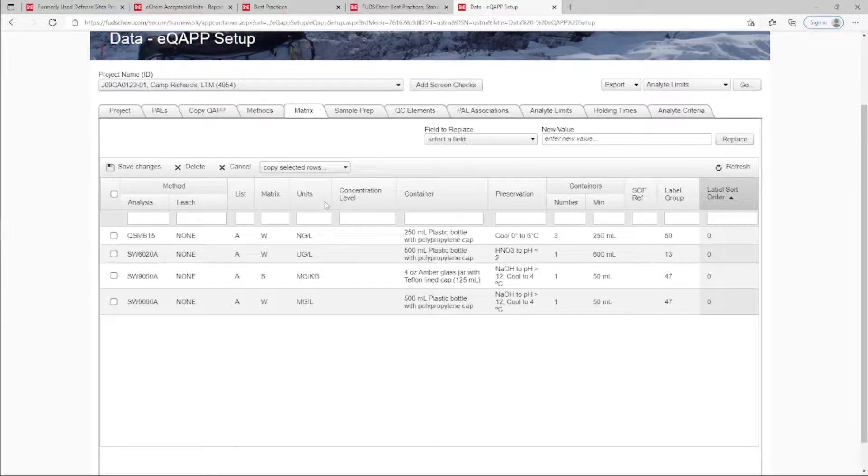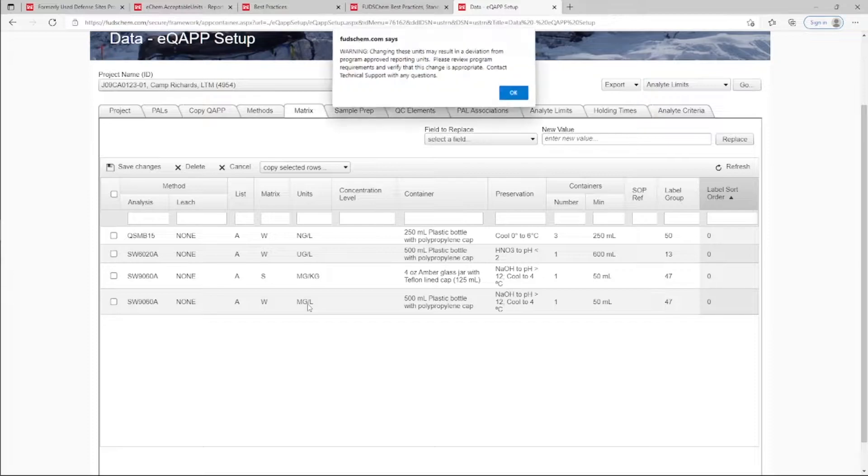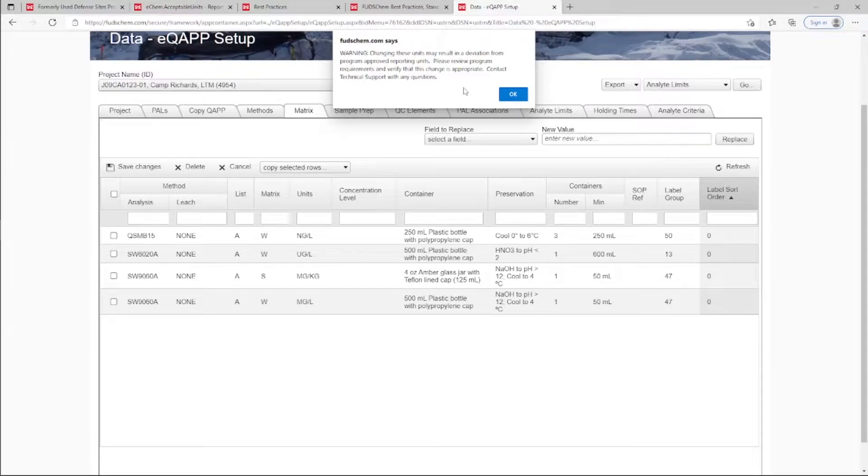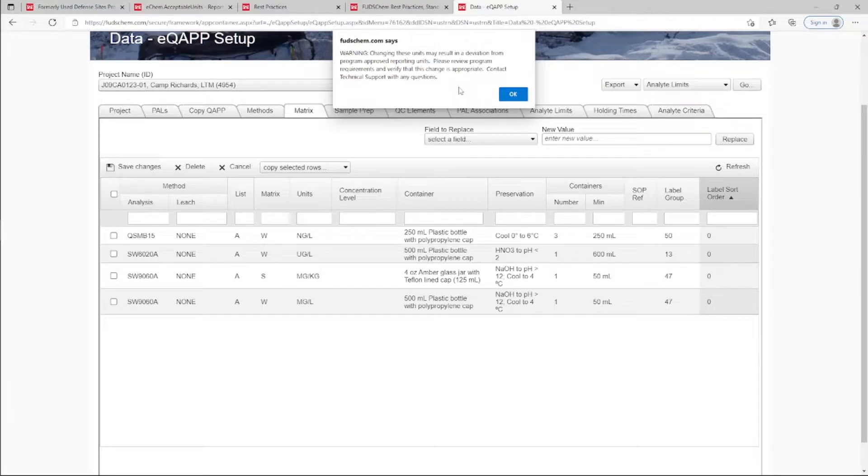Attempting to change the units on the Matrix tab will display a warning that changing these units may result in a deviation from program-approved reporting units. Please review program requirements and verify that this change is appropriate. Contact Technical Support with any questions.